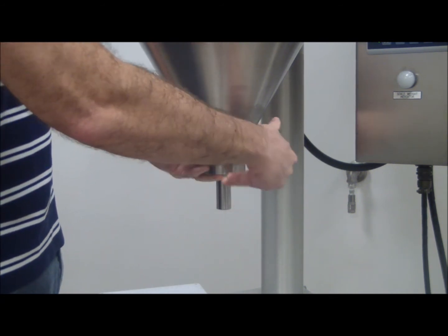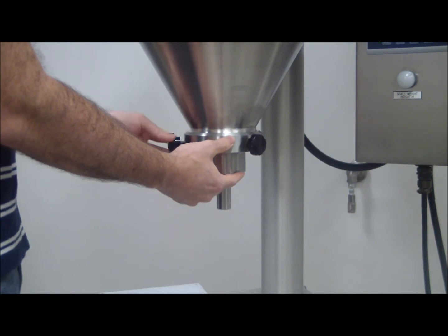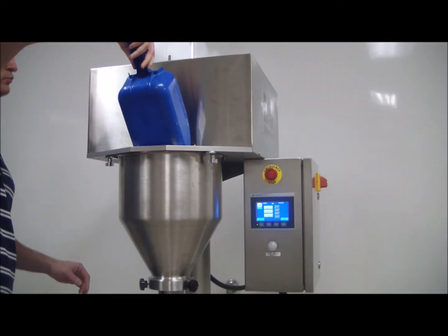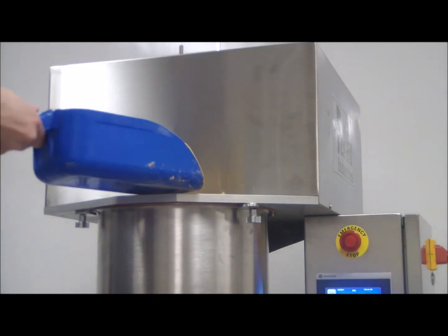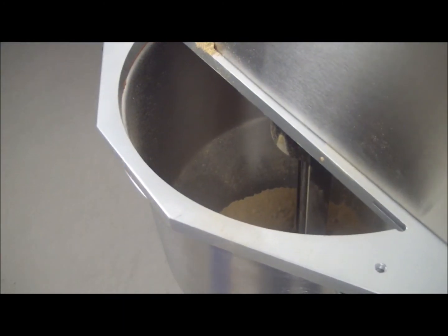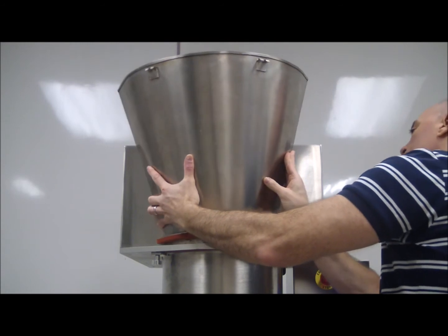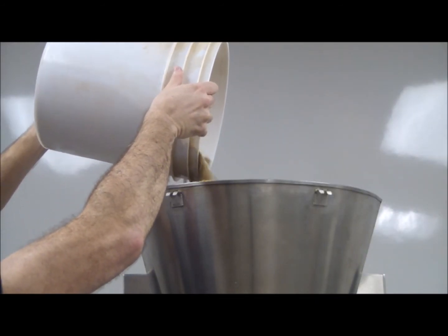Now that you've seen how quick and easy a toolless changeover is, let's take a closer look at optional accessories and the HMI. Each application is different. That's why we offer a long list of optional accessories, such as spring-loaded platforms, vibration, pneumatic lifts, and extension hoppers to make manual bulk feeding easy and also to integrate with your bulk feeding system.